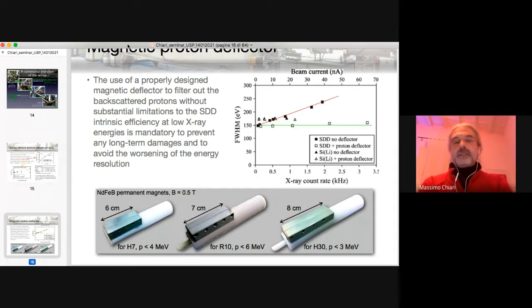So this could be a very nice tracer to determine, even without a lot of quantitative data analysis, just the presence of boron, yes or no, it could be used to distinguish.